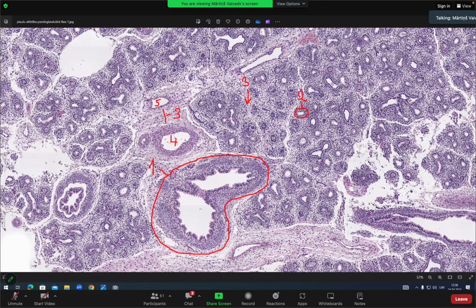And then there's another thing that can be labeled. I see in the slide description, it's not that well described. Please notice this. I will use a bit different color with orange. You can see there's a bronchiole that's splitting into two. So as the lungs develop, so bronchi and bronchioles are growing, they split into two. So this splitting in two has a specific name. So I will write number 6, dichotomic division.